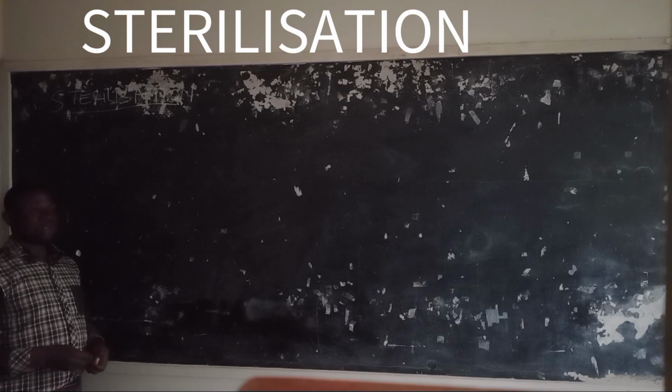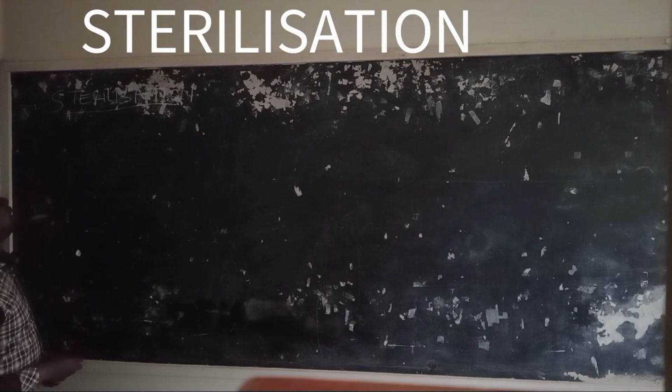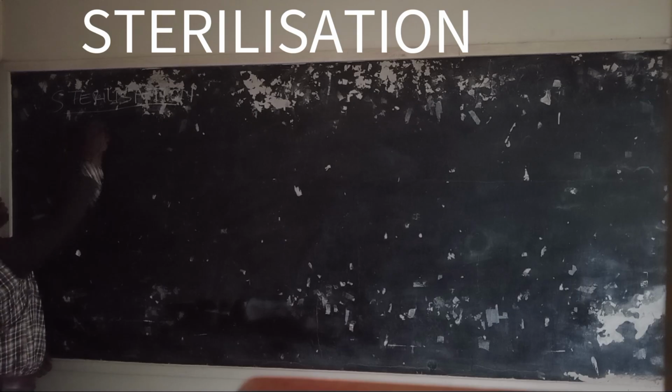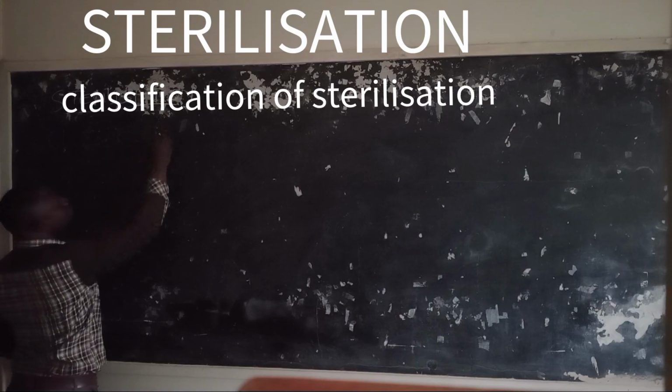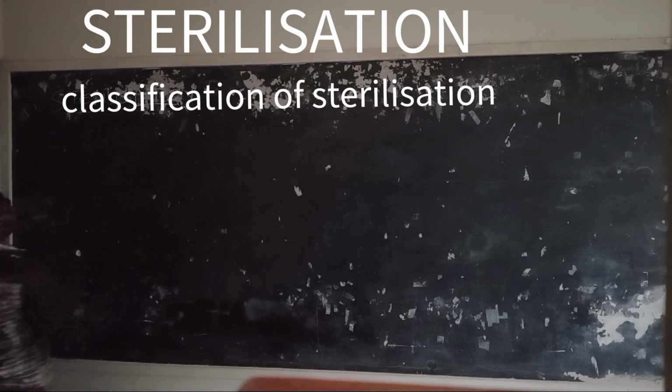Now, on the same topic of sterilization, we want to know the different classification of sterilization.